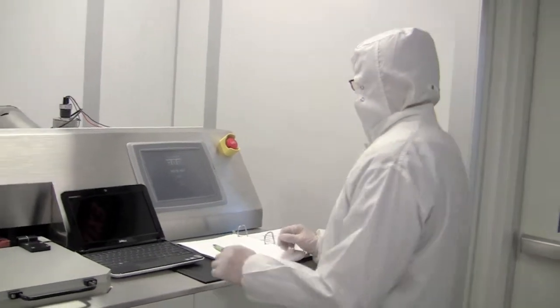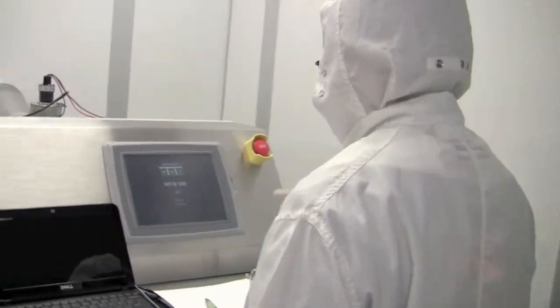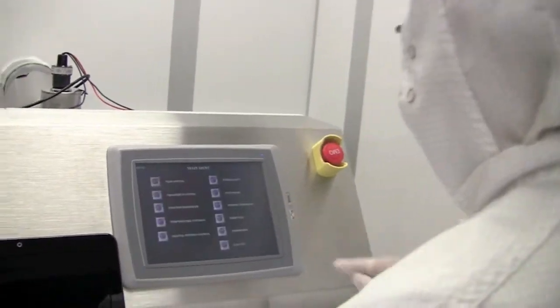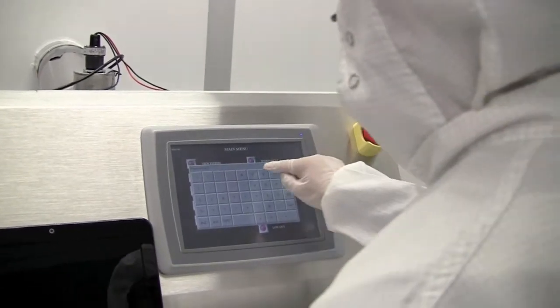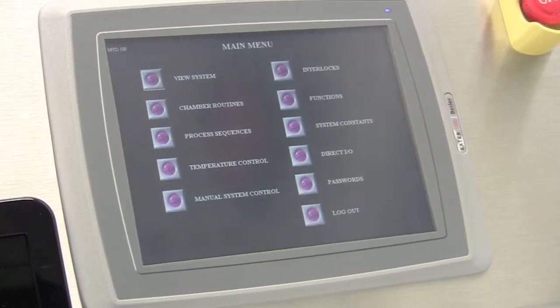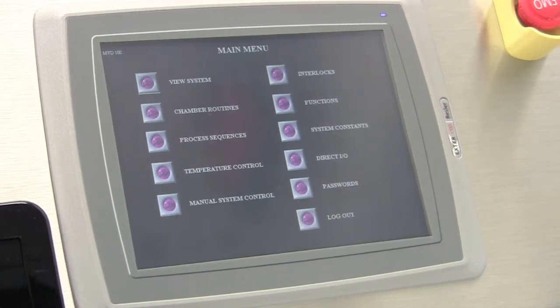After we come back from the chase room, we log into the system by touching this blue button. Enter your password. After logging, now we are on the page of main menu.